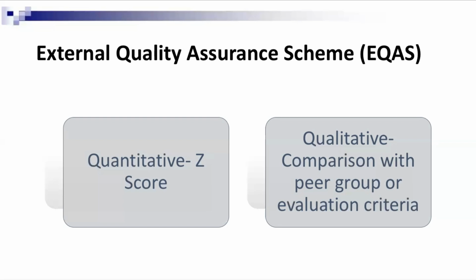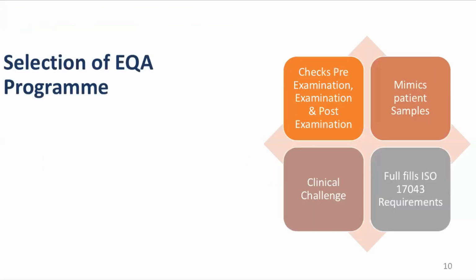In quantitative, we use Z score. Z score or standard deviation index. These are the same thing. Calculation is the same.